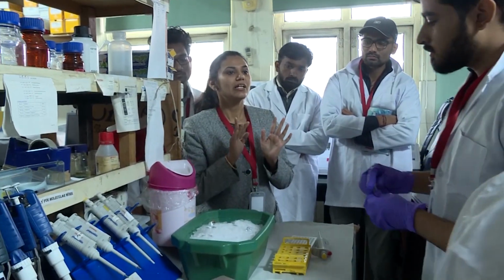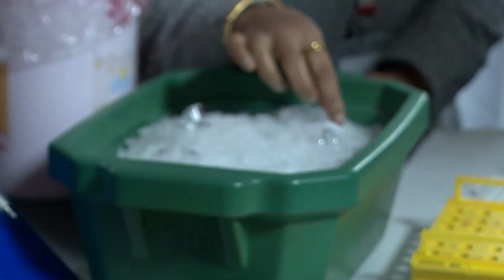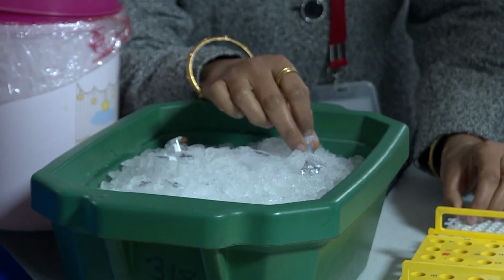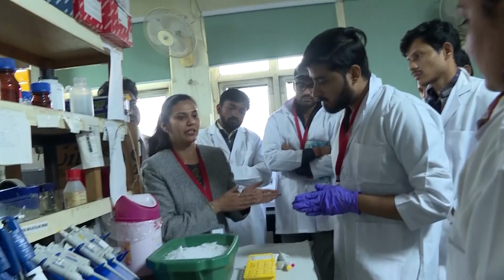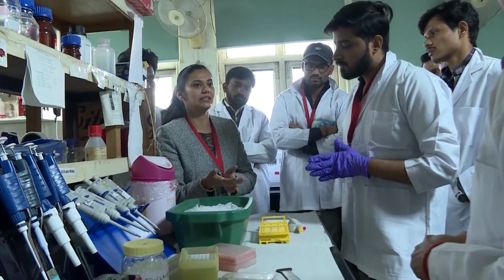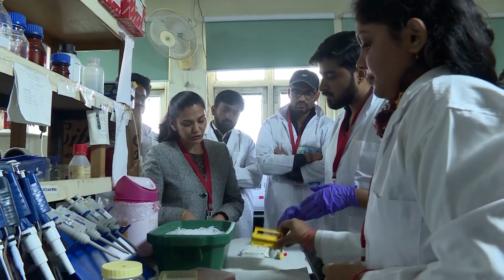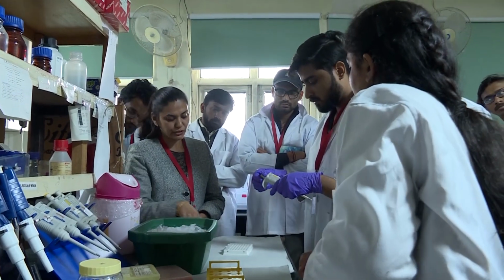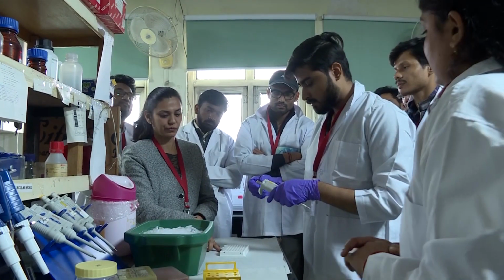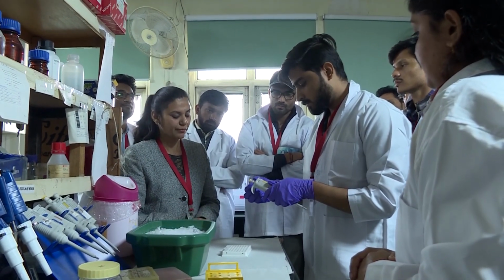Now only these two things are common in all the reactions. You have 4 different kinds of reactions, so we will divide this mix into 4 different tubes in equal quantity. Then wherever required we will add the primer and the cDNA according to our samples. In each tube you will divide 36.4 in all these four tubes. Set your pipette at 36.4.